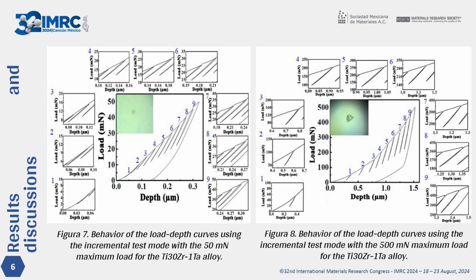The unloading-reloading curves demonstrate that the lines overlap at all 9 approaches, indicating a fully elastic behavior that is typical of a material with superelasticity. This behavior is observed as the material returns to its original shape with a decrease in load.